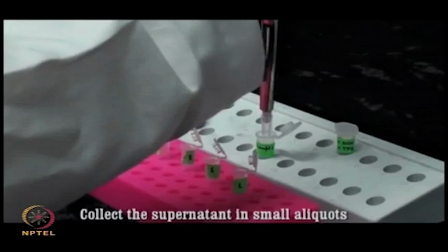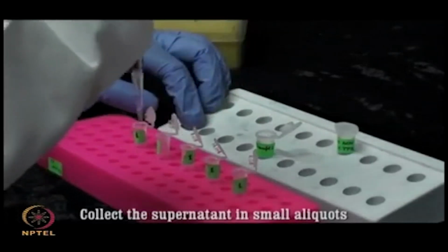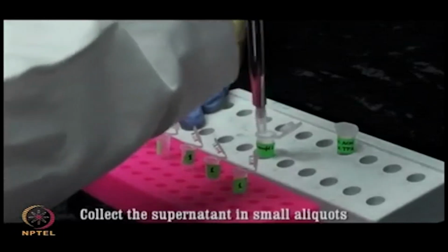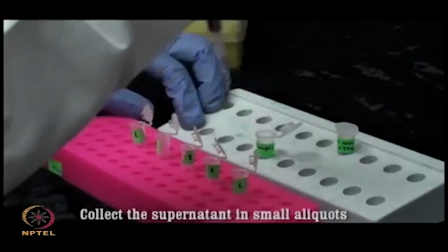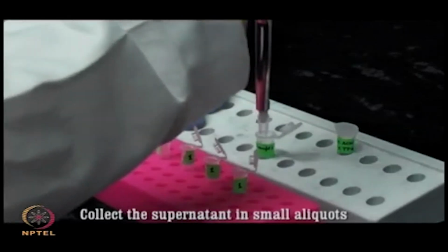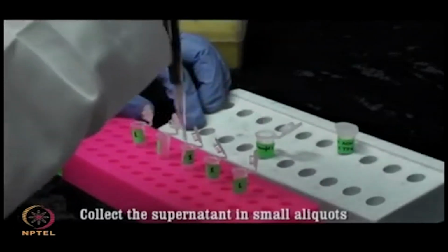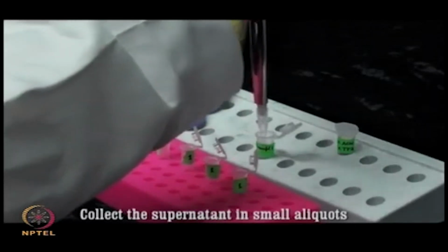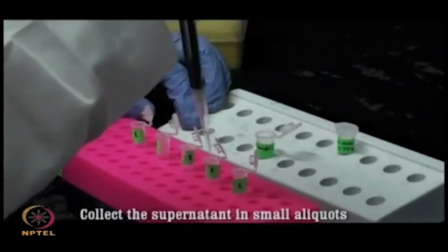Now, collect the supernatant in small aliquots, and extracted samples can be stored in these aliquots. Efficient extraction is essential to ensure the release of peptides from the gel matrix into the solution.